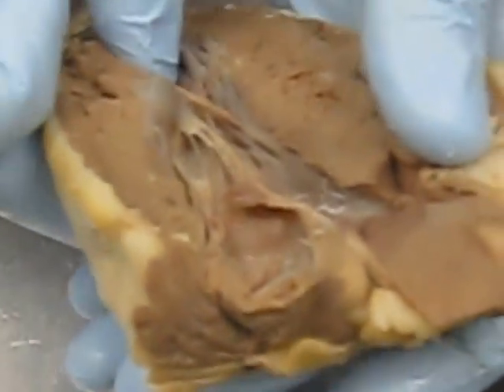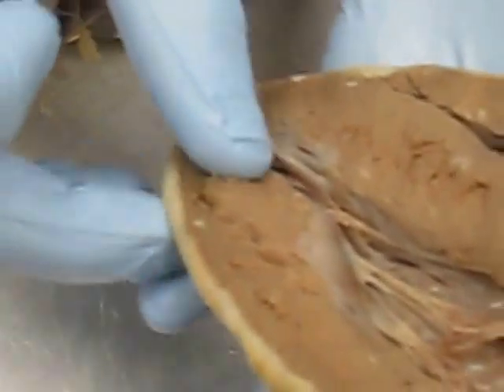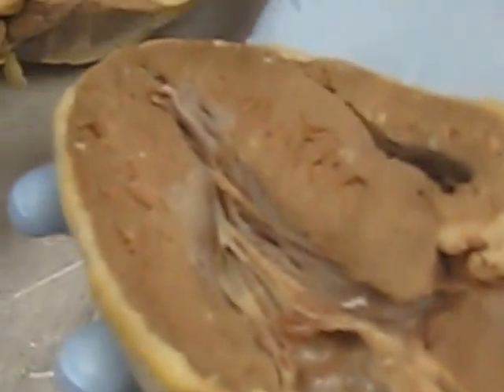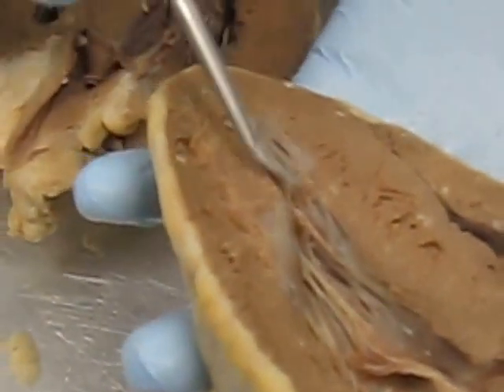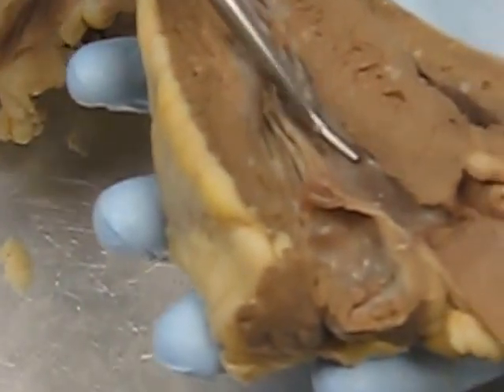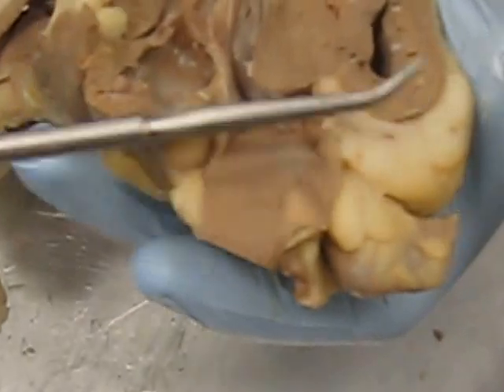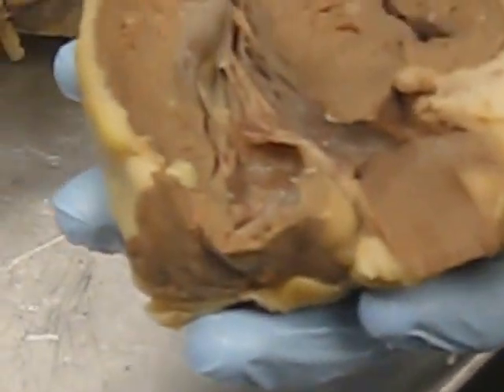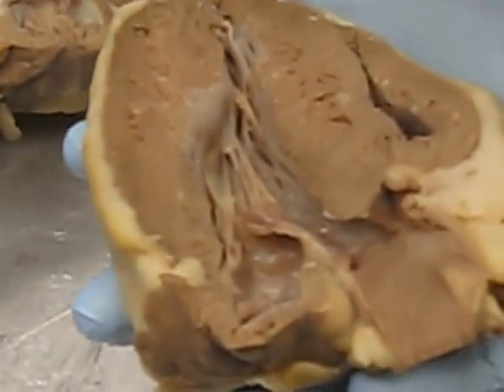This oxygenated blood sitting in the left ventricle needs to get pumped to the rest of the body. That's why the left side is so much bigger — it has to pump to the entire body. It does that by passing through the aortic semi-lunar valve, going away from the heart through the aorta. The aorta was cut in half here, but normally it would come around — and that leads to the rest of the body.